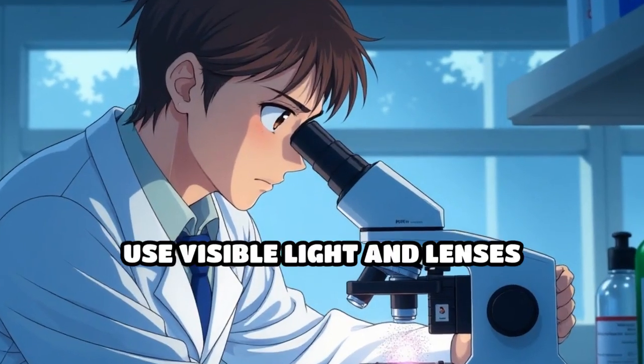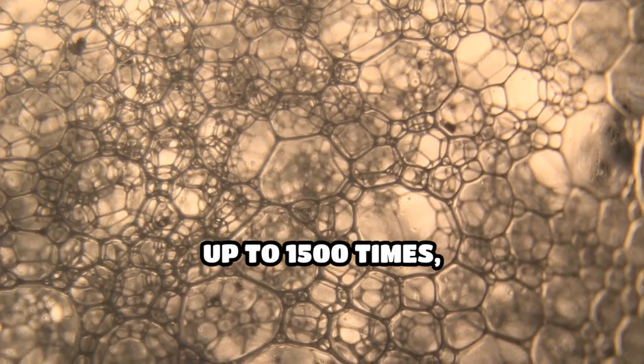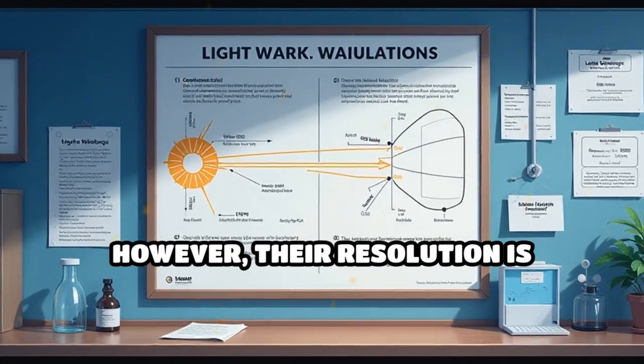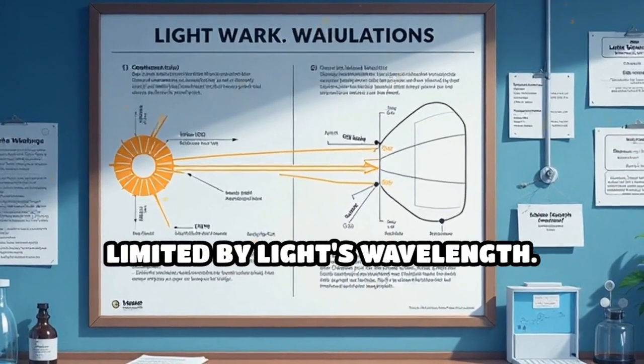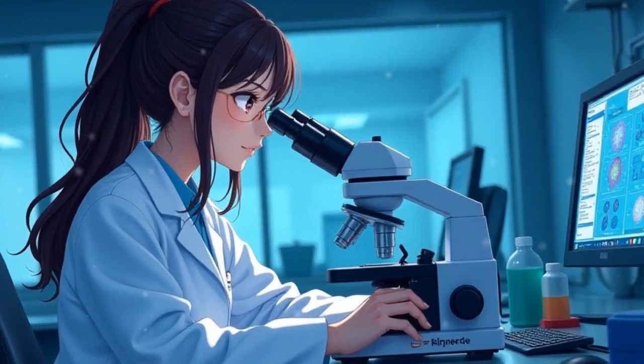Light microscopes use visible light and lenses to magnify specimens up to 1,500 times, ideal for viewing live stained cells. However, their resolution is limited by light's wavelength. Electron microscopes, on the other hand, use electron beams.